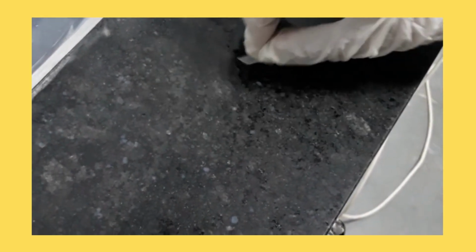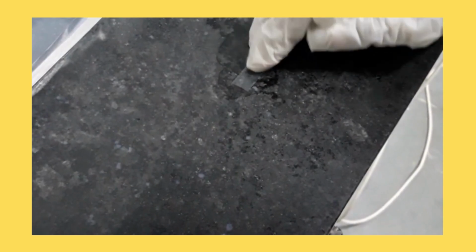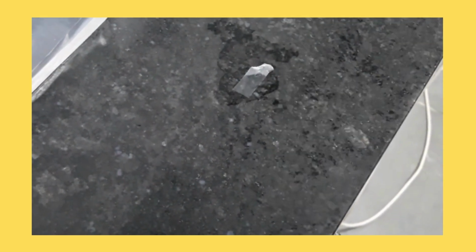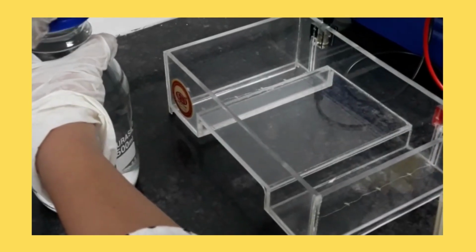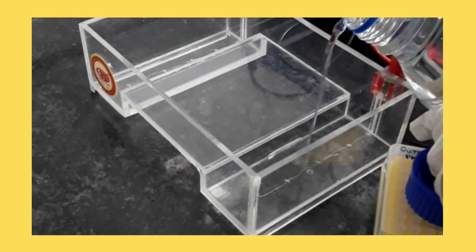Place the paraffin paper to mix the dye and the sample. Now pour TBE buffer into the apparatus.